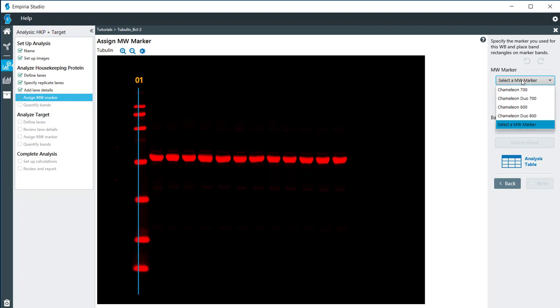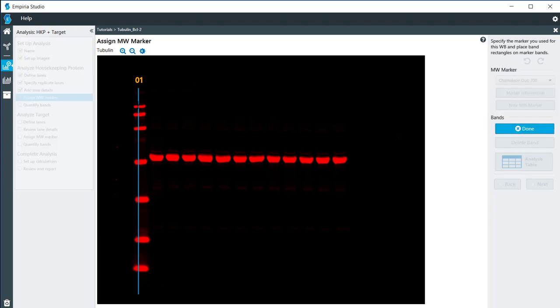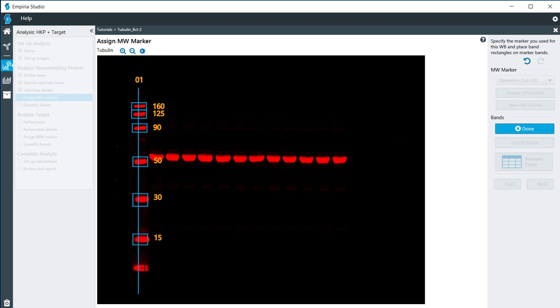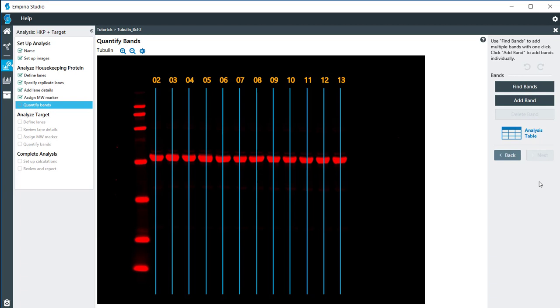For molecular weight determination, I need to choose the correct molecular weight marker. In this particular image, it is the Chameleon Duo 700. I'm going to add the bands on here, and then I can adjust those also if I need to move them around. But those are in the correct location, so I'm going to click on next.